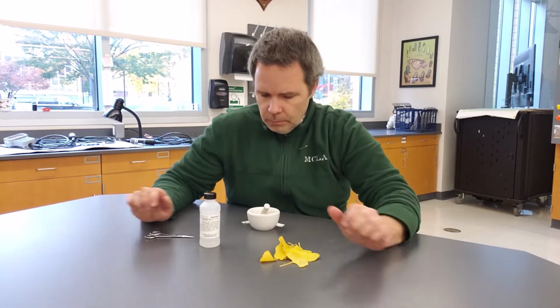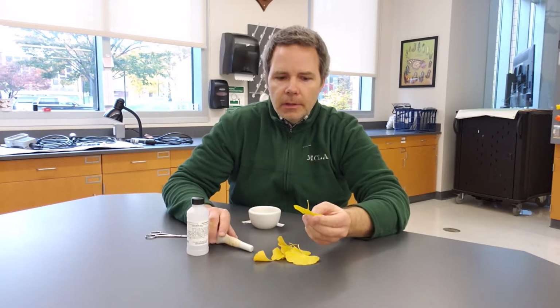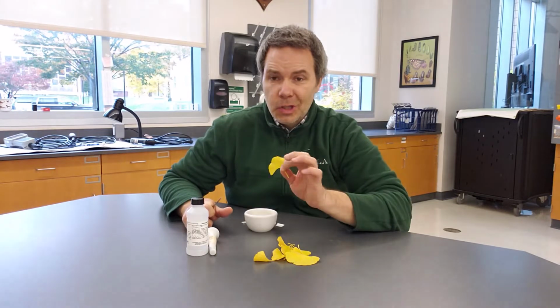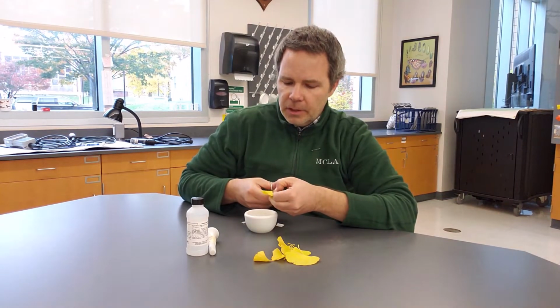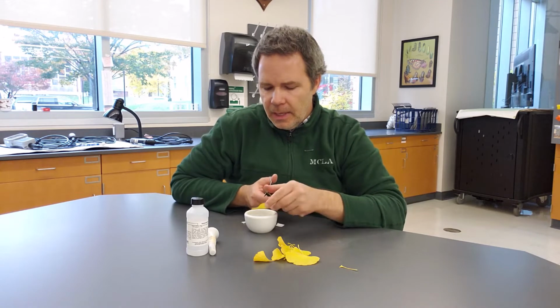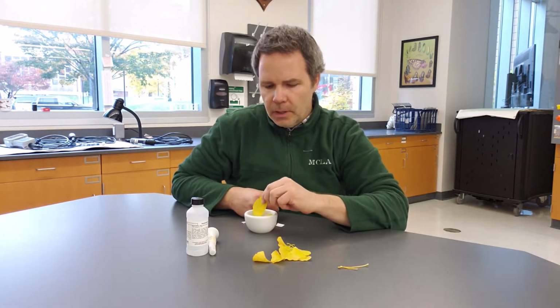All right, so what we need to do now is get the pigments out of these leaves. So what I'm going to do is grind these up into a little slurry, into a pulpy mess, into this mortar here. To facilitate that grinding, I'm actually going to cut off the leaf blade here. I'll leave the petiole, the leaf stem. I'm going to put the leaf blade into the mortar. I'm going to do that for a couple leaves.